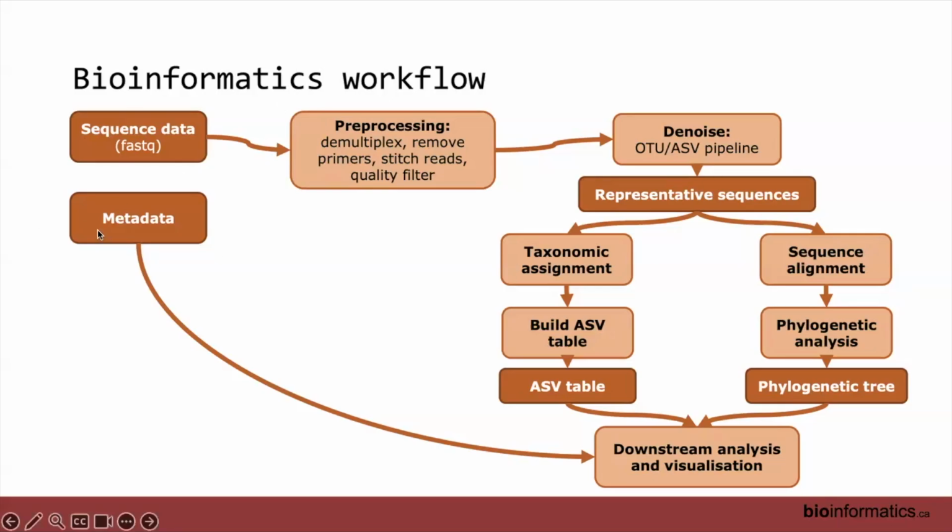And with this, we also then have a metadata file, usually, as Morgan talked about earlier. That's not really going to come into it today, but again, it will be coming into it tomorrow morning, where you'll be looking to combine this metadata table into some of this downstream analysis and visualization.